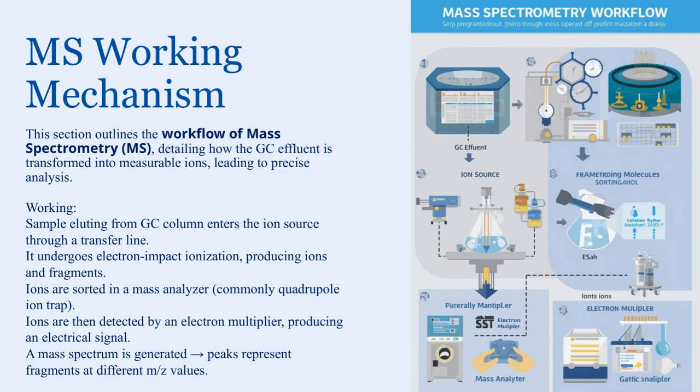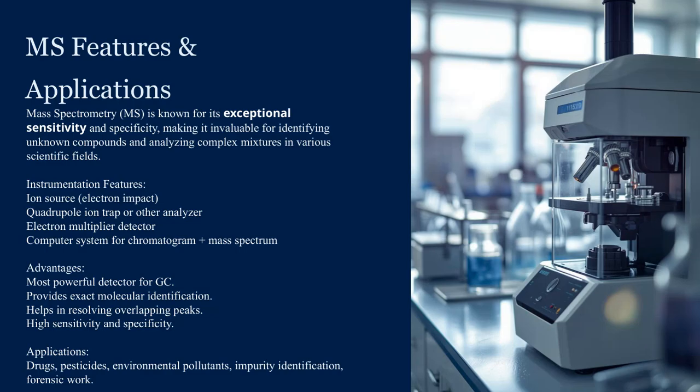Mass spectrometry, or MS, is renowned for its exceptional sensitivity and specificity, which makes it extremely valuable across many scientific fields. It's particularly powerful when it comes to identifying unknown compounds and analyzing complex mixtures.